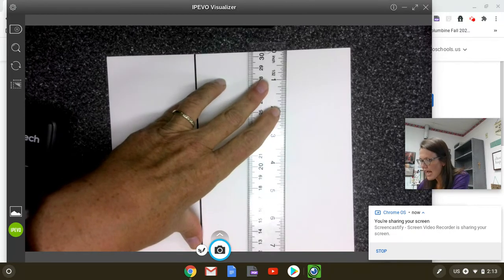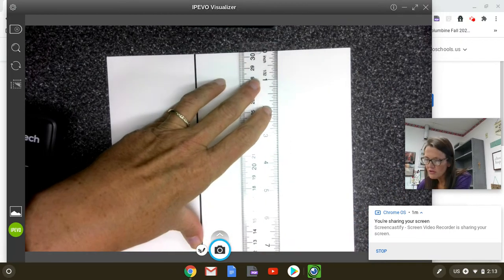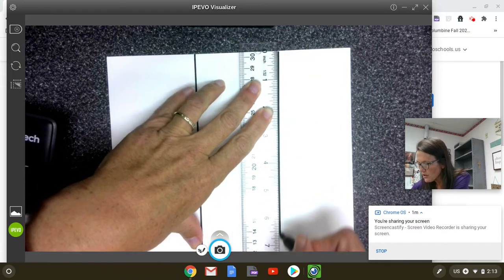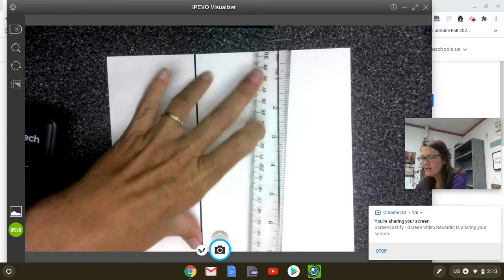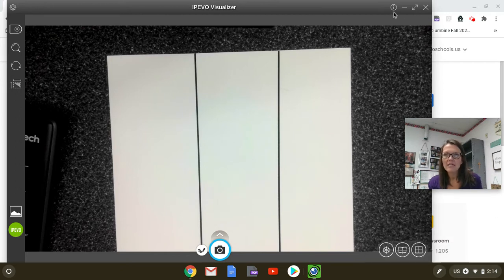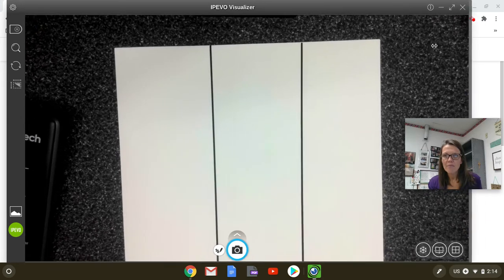Now I'm going to actually physically show you the different pieces of equipment. If you are not familiar with something that I'm showing you, then maybe you would want to also jot down a picture when you copy down your notes. But if you, for example, know what a beaker is and are confident that you would always recognize a beaker, then you don't need to write anything else down. Okay, you don't have to draw a picture. You can just put the name down. Let's see here. I'm going to see if I can get this a little bit bigger.